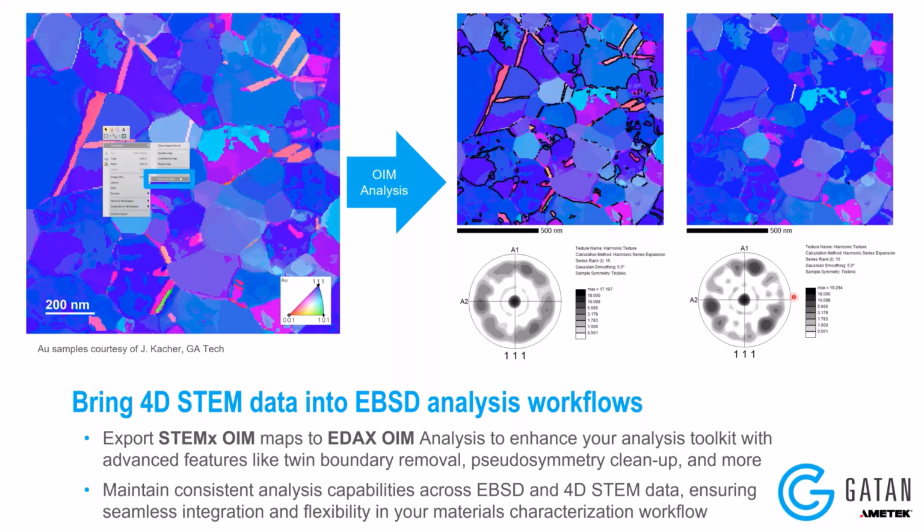And if we look, for example, at the pole figures here, we can see that these three dark spots essentially represent the 60-degree orientation relationships in the texture that we were seeing from this 1-1-1 orientation that is found in the majority of the grains of what we were looking at in this sample. So that's a really cool way of also combining a 4D STEM data workflow with an EBSD data workflow in the SEM.